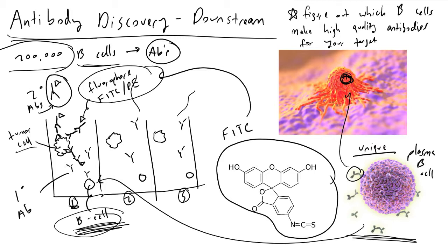And because we have such a high concentration of fluorophores present, something really cool will happen when we shine light at a very particular wavelength onto this. And so the FITC fluorophore is sometimes called the 488. You'll see the number 488 commonly associated with FITC. The cool thing that happens here is that when I shine a 488 nanometer wavelength photon onto FITC, without diving too deep into the physical chemistry, you'll have electrons get excited, and then when they relax, they will release a lower energy wavelength photon of 520 nanometers.